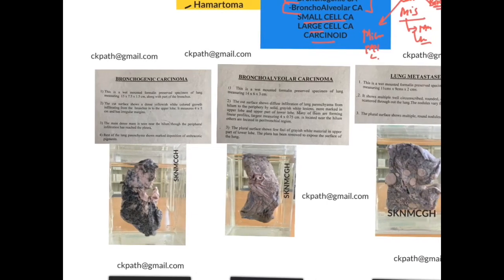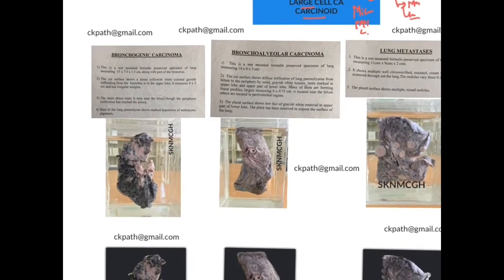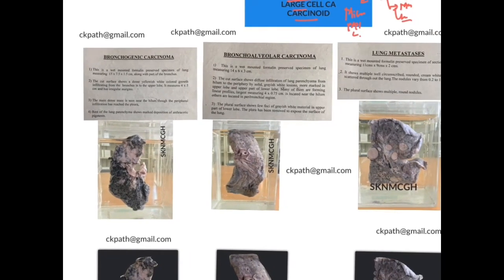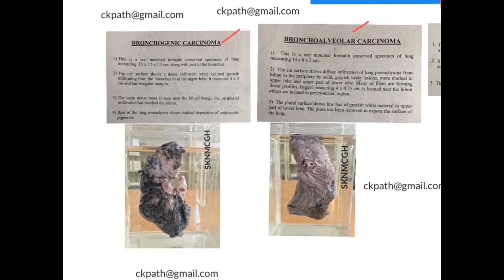So coming to the specimens, there are three specimens which we are going to learn today in the practical: the bronchogenic carcinoma, bronchoalveolar carcinoma and the lung metastasis. These three specimens we have in our laboratory. Coming to them one by one, first the bronchogenic and bronchoalveolar carcinoma.